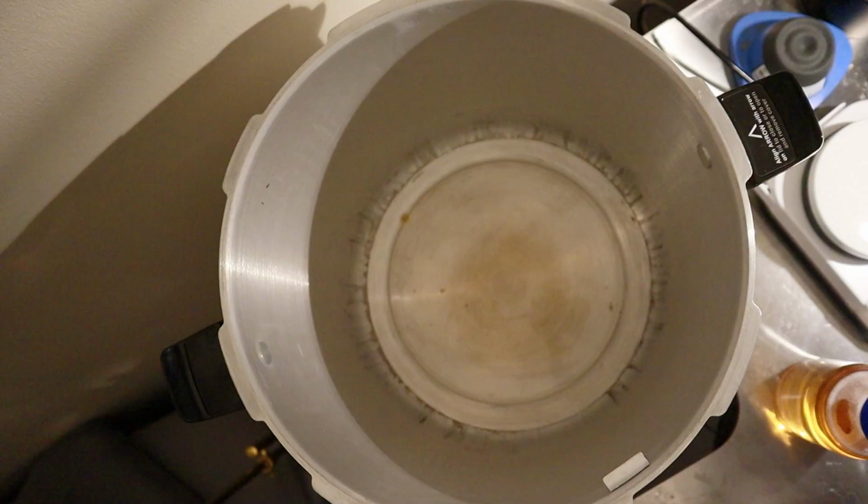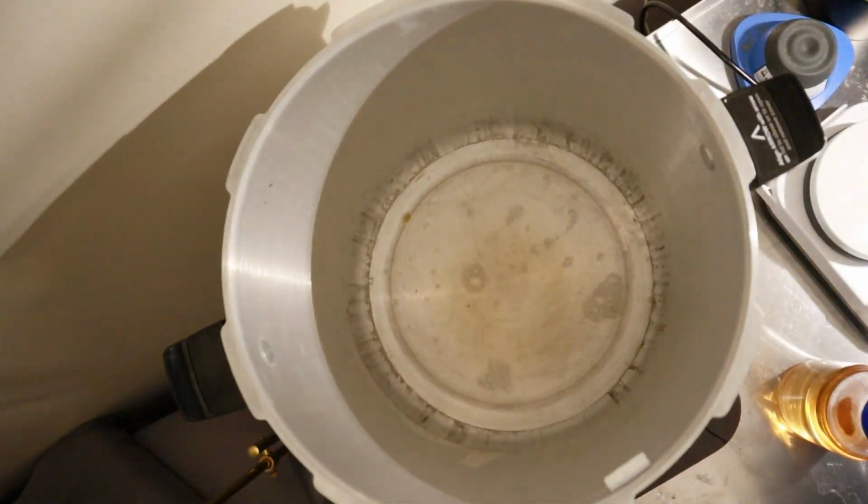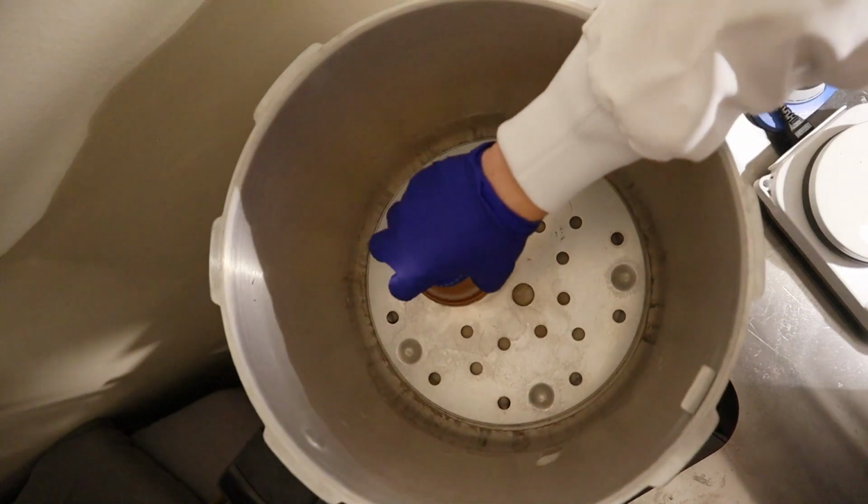After 15 minutes, this is enough to kill most microorganisms, as well as destroying the spores some of them use to grow back. To do this, I added water to the bottom of my induction-capable pressure cooker, put in the strainer, put the agar bottle in with the cap loosened to prevent it from becoming a pipe bomb, and I added a strip of autoclave tape on top. Oh wait, I didn't. Oh no. Yeah, I forgot to do this.